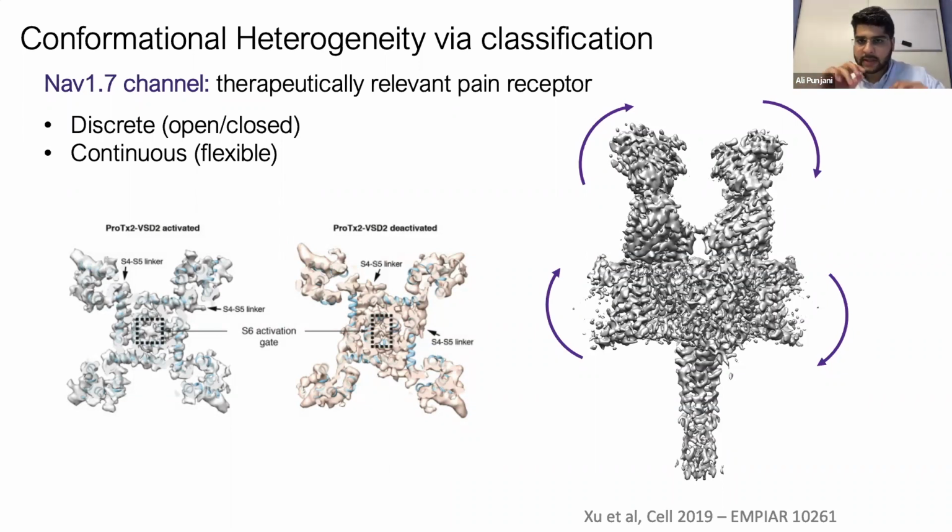Simple mode just creates this simple movie of 20 frames or however many frames you want, linearly interpolating along the linear subspace model to show you what each variability component is capturing. It doesn't take into account anything about the distribution of particles in the latent space or clusters or anything like that, just simple. The cluster mode does what it says, which is it takes the particles in the latent space, clusters them into as many clusters as you ask for using a simple Gaussian mixture model clustering, and then reconstructs a 3D structure from each cluster and outputs those.